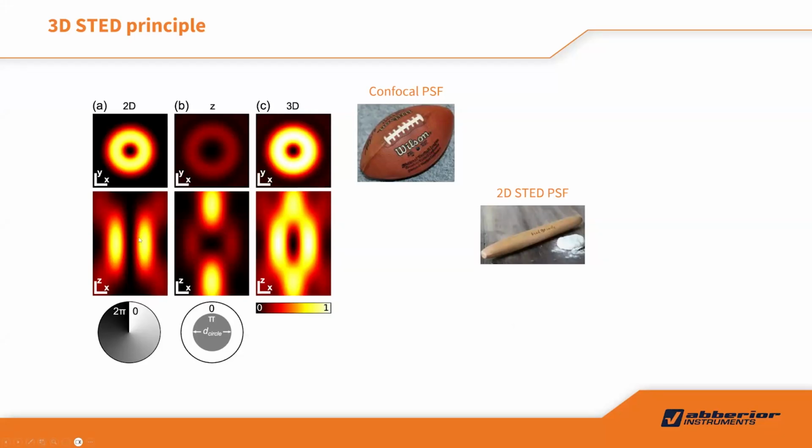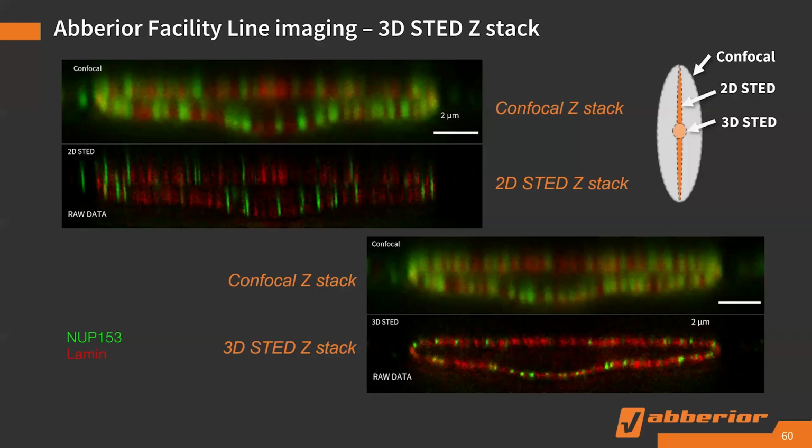If you want to have the 3D STED effect, you must have a 3D STED donut, so at the focal plane, up and lower. However, then the 2D performance is poor. So if you want to have a 3D PSF of the STED, you have to combine the 2D donut and 3D donut and make them together a perfect 3D STED PSF to shape the confocal PSF into a small dot from the 3D point of view. The concept is easy, right? And the effect is also very good.